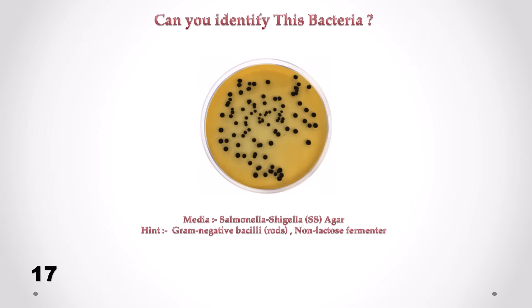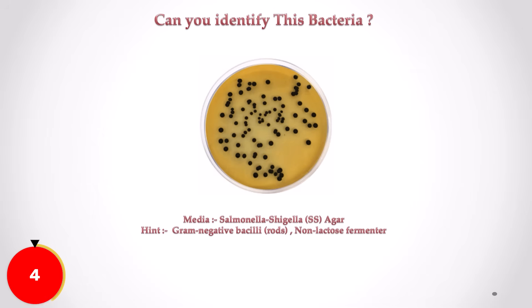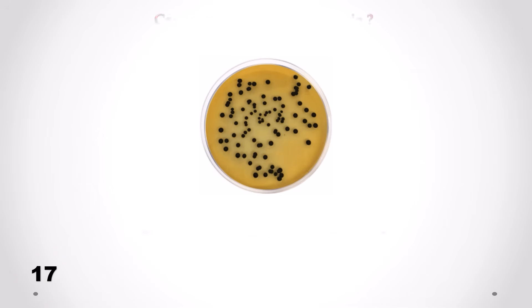Can you identify this bacteria? Correct answer is Salmonella. We can see black centers from H2S production.